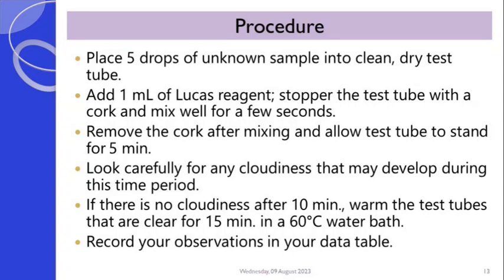Then you add it to your sample. You cork it and then you mix it well for a few seconds. After you have mixed it through shaking, you may now take off your cork and then allow the mixture to stand for a few minutes, in this case 5 minutes.